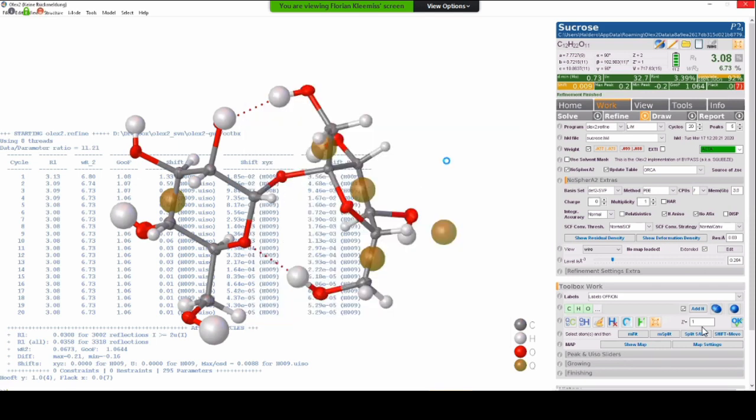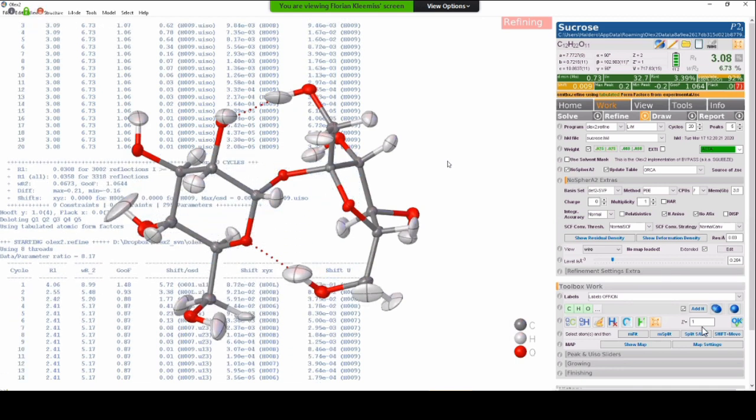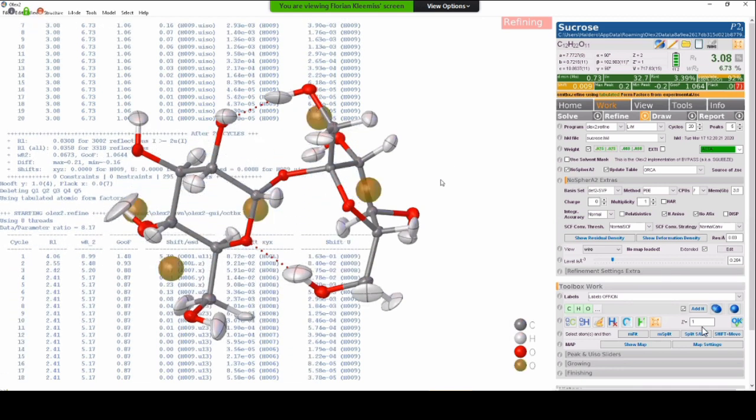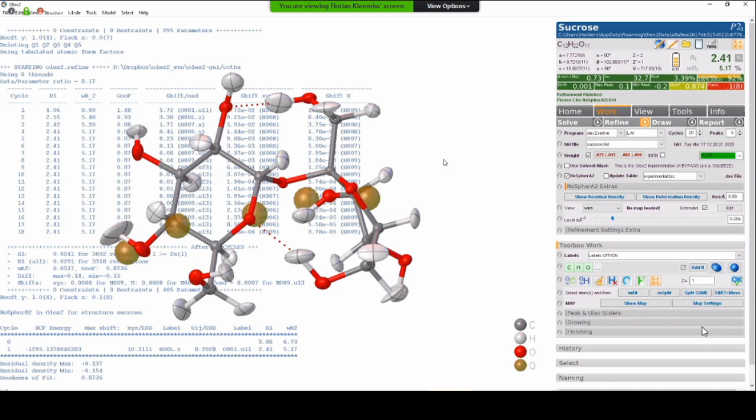And this might be useful to spot, for example, an error. If you have the wrong multiplicity and the wave function tries to squeeze away some electrons somewhere where they shouldn't be, you can most likely see this in unreasonable charges somewhere. For example, some 10 times charged carbon atom or something. You should be worried if that happens. And most likely something is wrong in your wave function calculation.